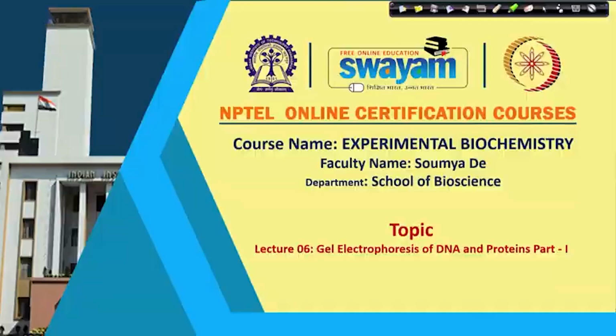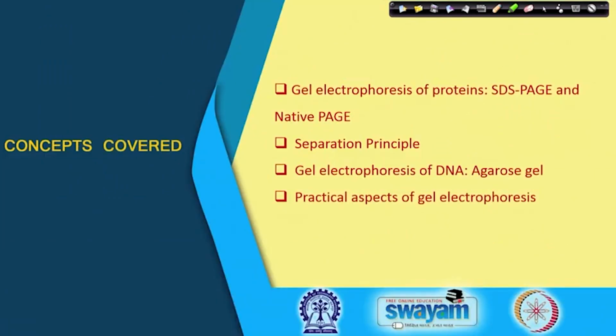Today I will talk to you about gel electrophoresis of DNA and proteins. This is a two-part lecture, and in this part I will talk about the basics of gel electrophoresis, and in the next part I will talk about some of the applications of this method. Gel electrophoresis is a very versatile technique that is used in almost all biological labs.